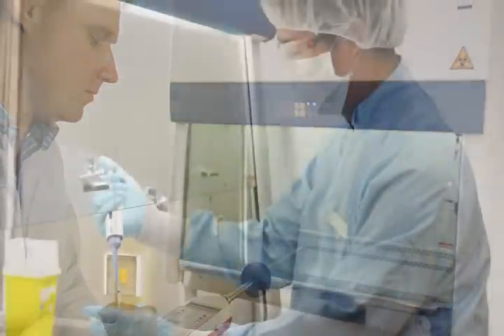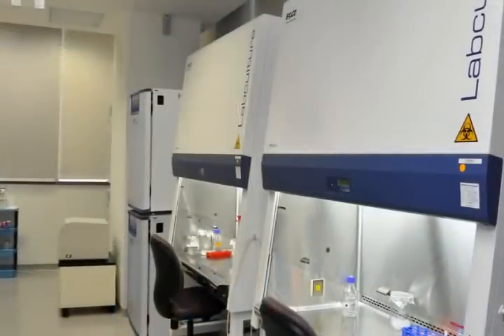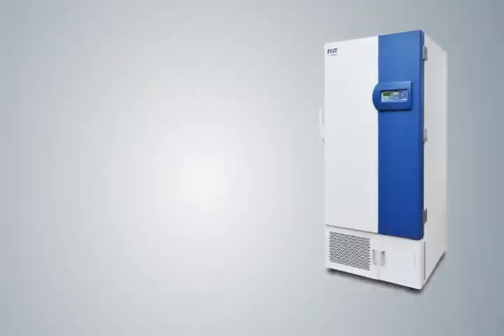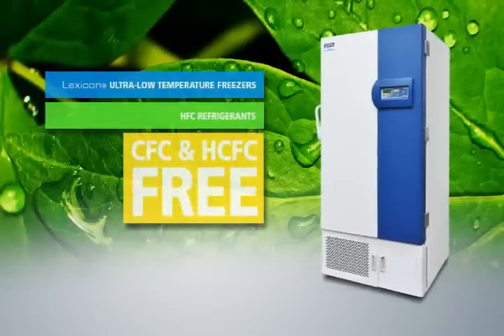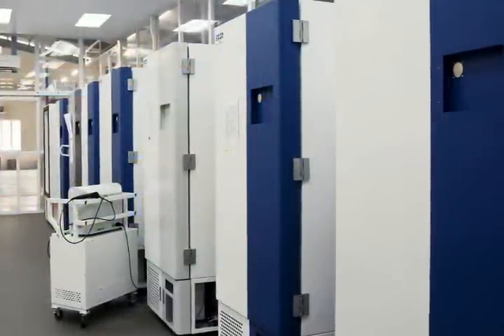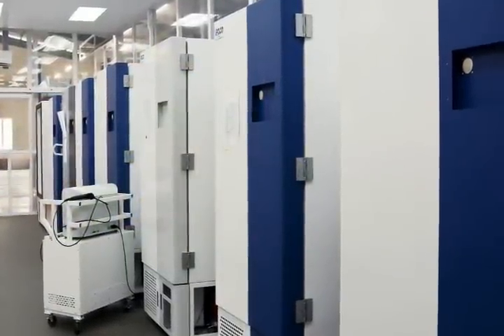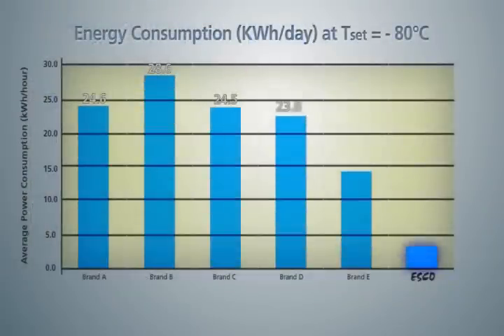ESCO is dedicated to providing environmentally friendly, efficient green products. Only CFC-free and HCFC-free HFC refrigerants are used. Biodegradable high-performance synthetic polyester oil is used, resulting in comparatively low energy consumption and low heat emission.